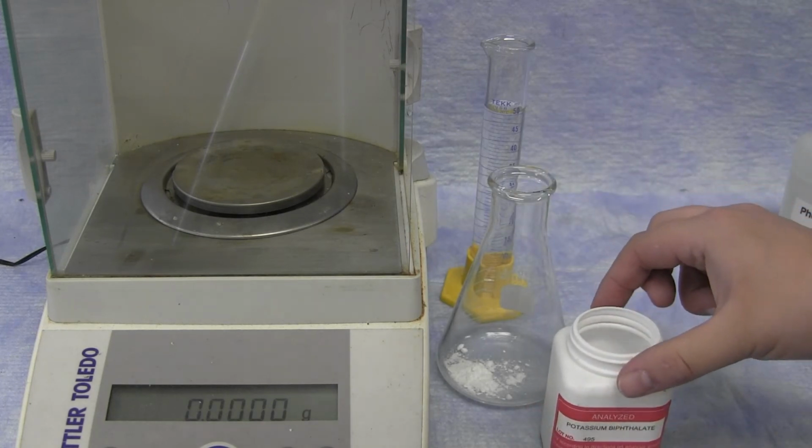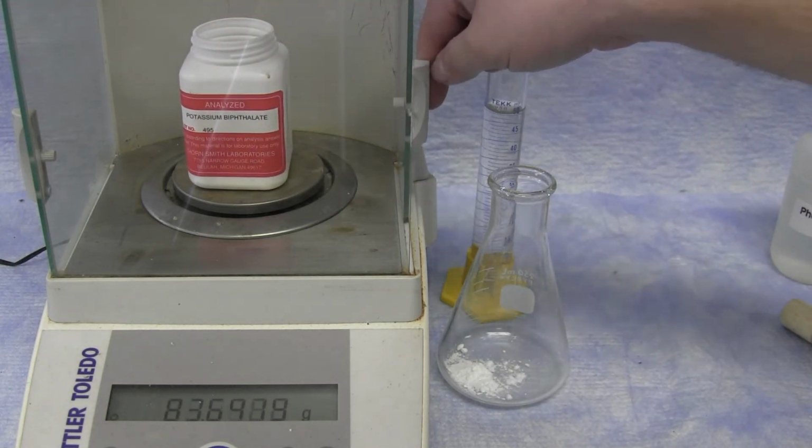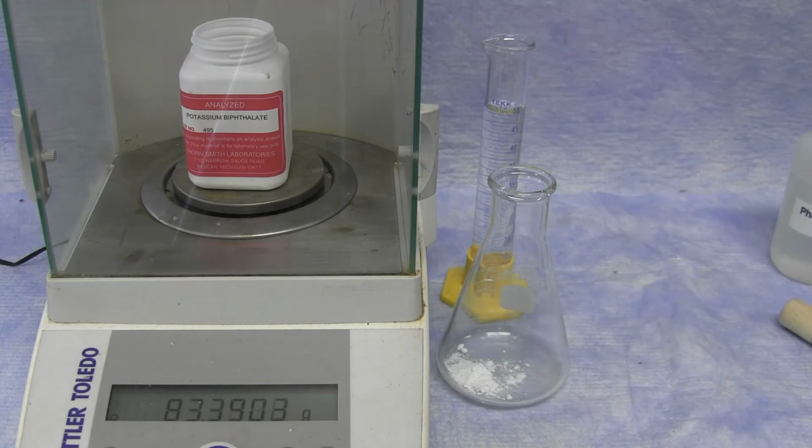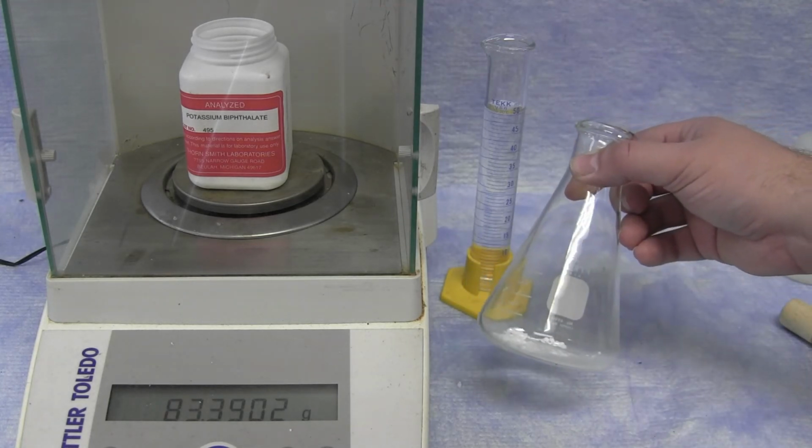The amount of material added should be between approximately 1/2 and 1 gram. You can then weigh the entire container again. The difference between the first and second weighings of the container is the mass of powder that was added to the flask.